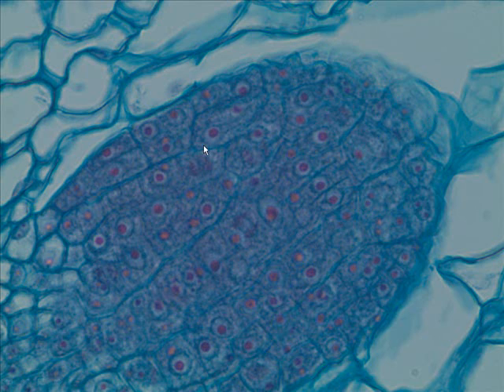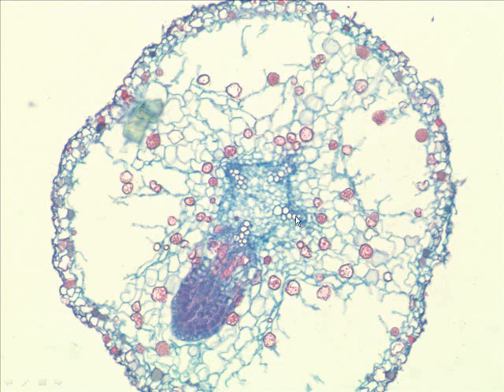The root cap. What about this region in here? You call that what? You'd call it the what? The apical meristem. In fact, as you can see, cells undergoing mitosis right here, right in front of our very eyes.